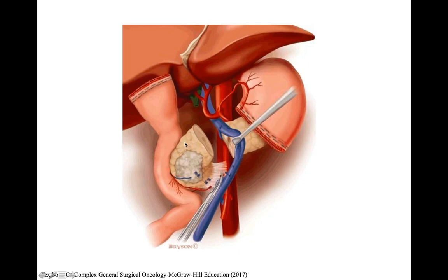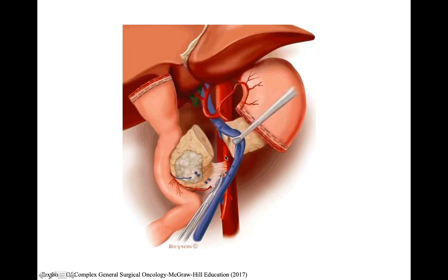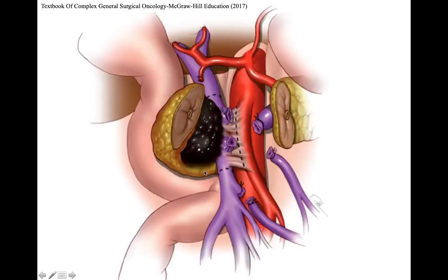The uncinate margin is important and can be confusing, but uncinate truly translates to hook. It's the part where the pancreas is very close to the vasculature, kind of wrapping around it. The significance of the uncinate margin can be demonstrated here, because if the disease burden is very high, you could see that the tumor can potentially involve the vasculature, and this could be a potential positive margin.